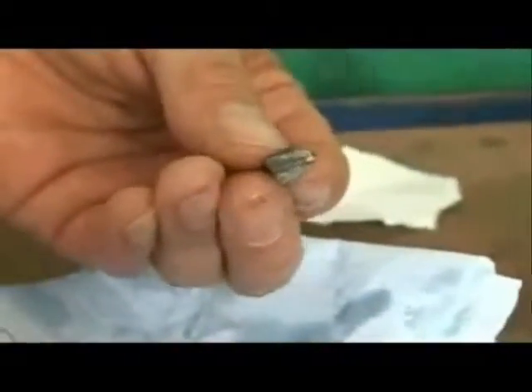You can see freshly cut lithium there, nice shiny metal. But as it reacts with the nitrogen, it forms the nitride, which is black. It reacts with nitrogen in the air. It's one of the few metals that will react with nitrogen spontaneously.